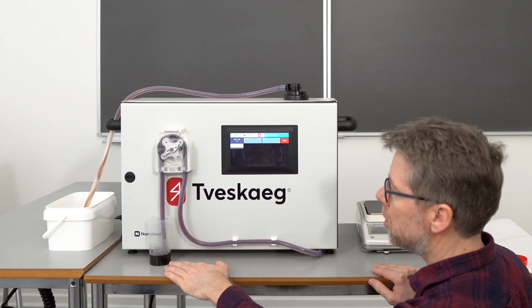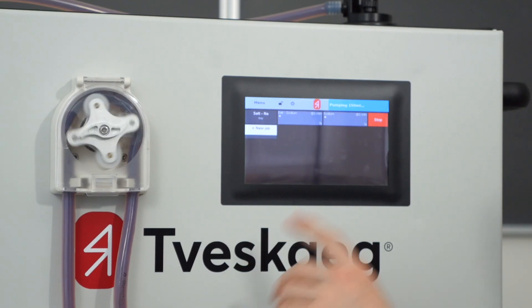The run itself, because the sodium content is pretty high in this sample, is going to take one minute. So after one minute we'll have a look again.